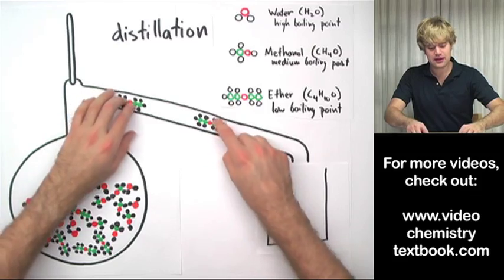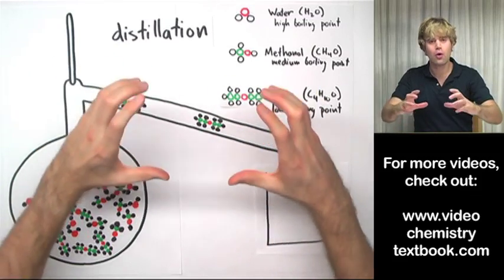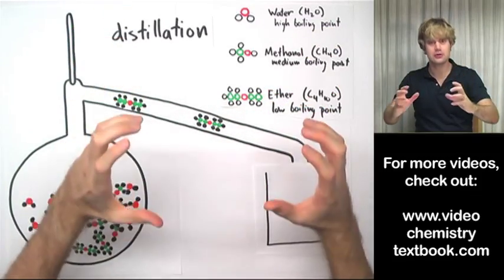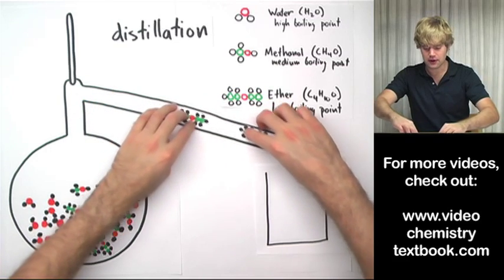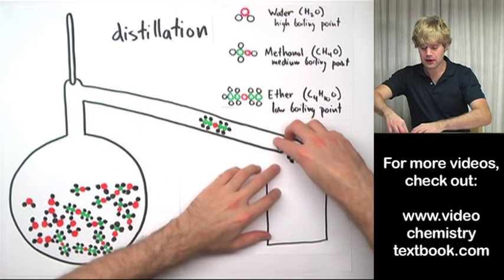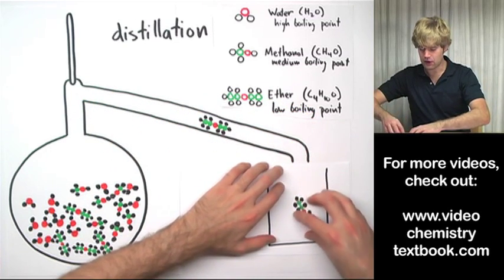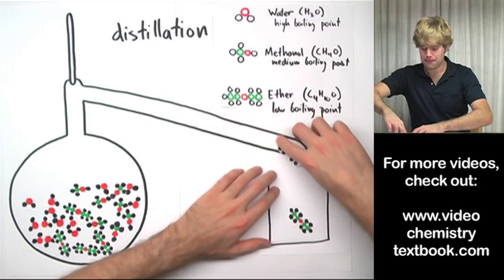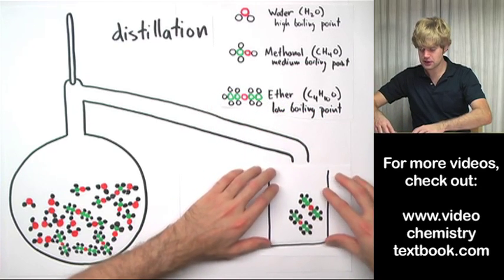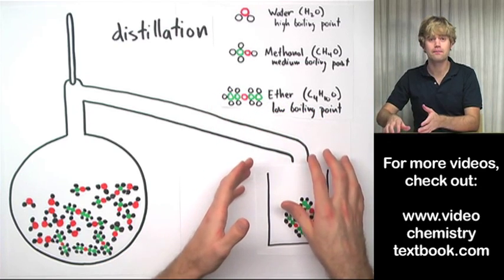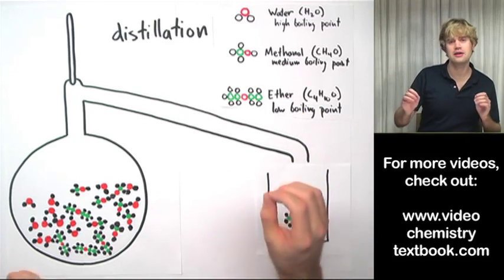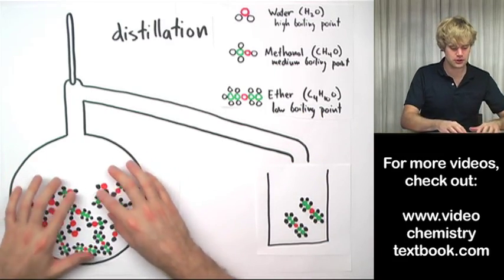And as they move down the condenser, they're going to get colder and colder until the gas ether turns back into liquid ether. And then this liquid ether is going to drip down into a beaker or glass that I have waiting right here. So that's how I'm going to get the ether out. At a low temperature, it starts to boil.